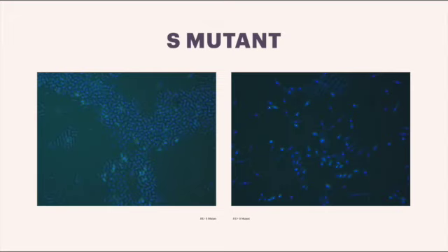In regards to the GFP production, the HU minus will be the reference, while on the right side for the HU plus, you will see that there is less production. This will also lead us to believe that it is a DNA repair mutant.